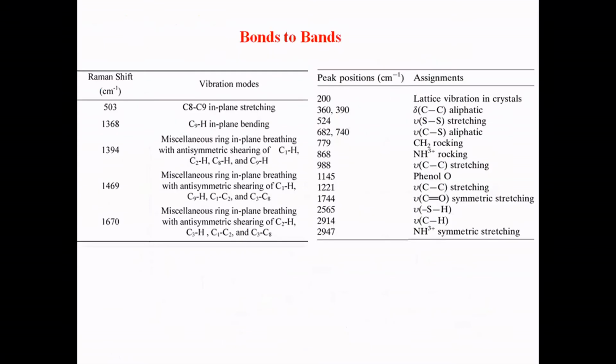And in the same way, some of the key Raman shift values, or the frequency numbers, tell you about the structure. From the piece of bonding information, you can have an idea what compound it is, because the functional group is the key. The other structure, the other skeleton, will be the same, but the functional groups are more reactive or sensitive in the molecule. So you can exactly tell about that information.